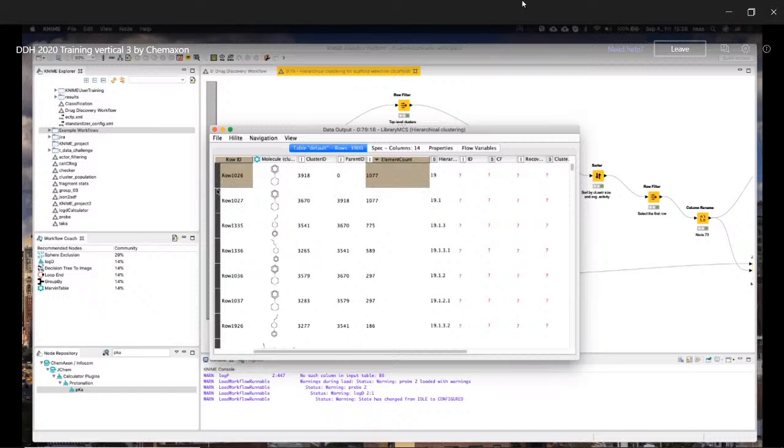I want to show you this one. It's just that my mouse is not willing to show you that. So it's basically this molecule. Now we visually know which is the one that we need to select.